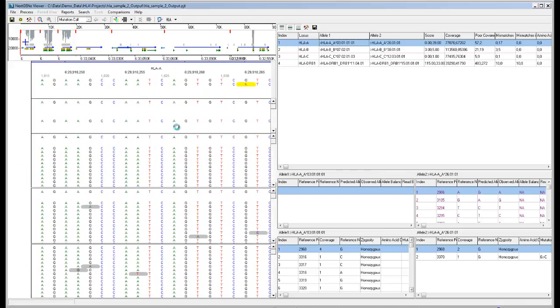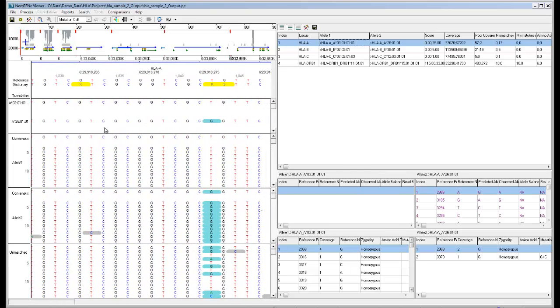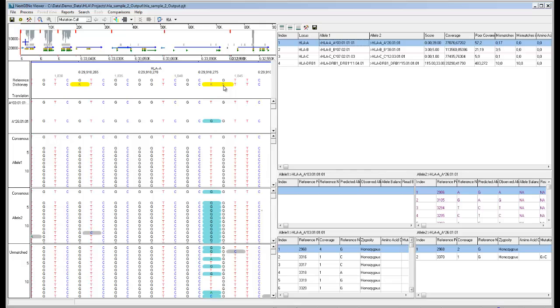The dictionary sequence is shown with yellow highlighting for the positions of polymorphisms, using a IUPAC nomenclature. While conserved positions that are the same for all known alleles for the gene show no highlighting.